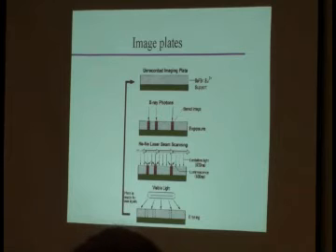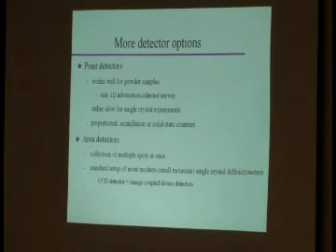Disadvantages: it takes you about 5 minutes to go through this process. So there's a turnaround time for image plates. But compared to film, quite nice. So what else can we do if we don't want to wait for 5 minutes?